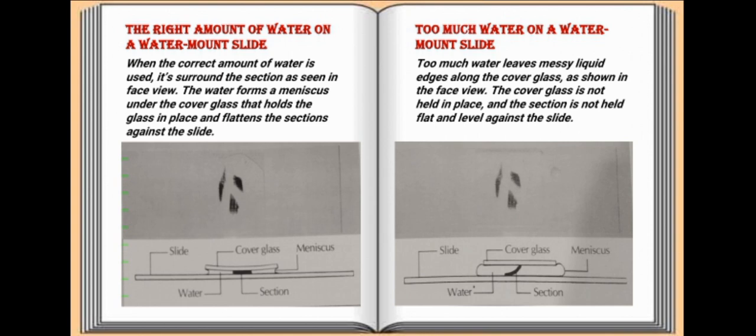Having too much water on a water mount slide can cause several issues that affect the quality of the observation.